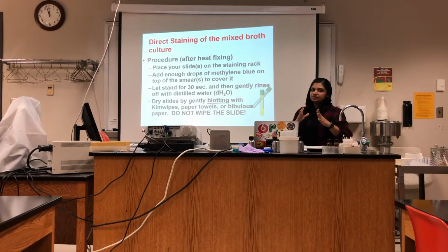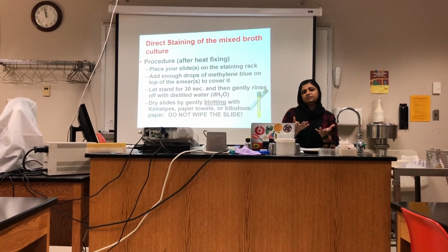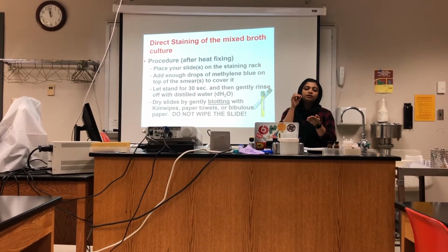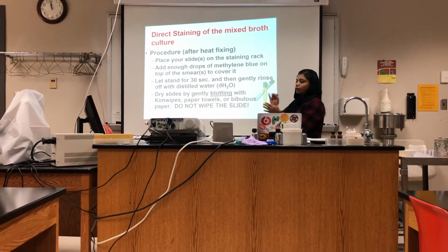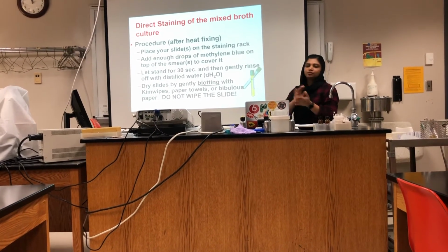We let it sit for about 30 to 60 seconds, and then gently rinse the slide with distilled water and allow it to air dry again. We just want to dry the slides by gently blotting on the sides. You should be careful that you do not wipe the slide.